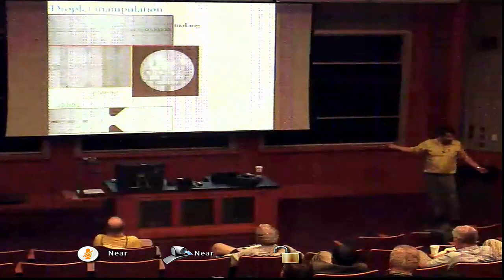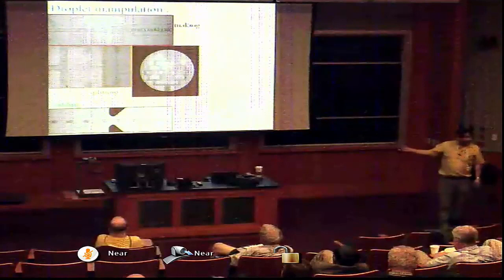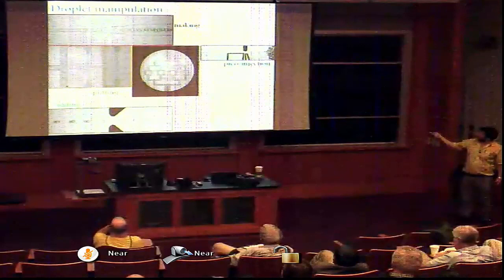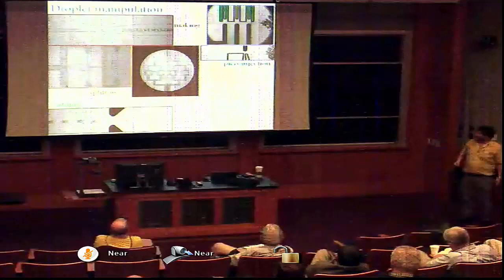Water has a high dielectric constant. Oil has a low dielectric constant. You put an electric field across something with a high dielectric constant, you induce a dipole. You have 2 drops, 2 dipoles, same direction. They attract. They coalesce. Another way of mixing is what we call a picoinjector. Again, an electric field breaks the interface between an injecting fluid and the drops. Every drop that comes by this one gets literally a picoliter of fluid injected into it. This is controlled by electric field, so we can have a whole series of injectors, and only this one is turned on. We can now mix and match on a drop-by-drop basis as many as we want.